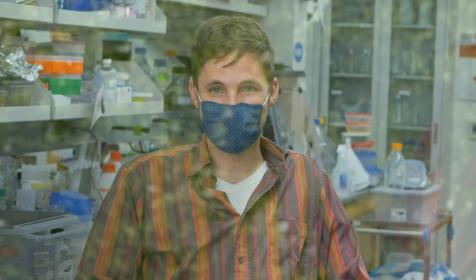Hi, my name is Adam Larson. I'm a post-doctoral researcher in the laboratory of Manu Prakash. Recently, I've been working on frugal solutions for COVID detection. And now I'm going to walk you through the steps of the Handifuge LAMP assay.